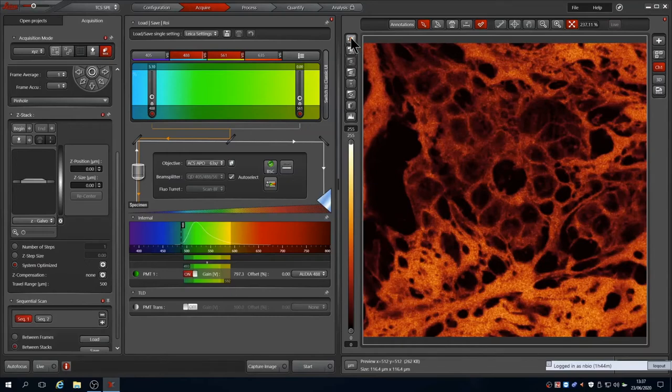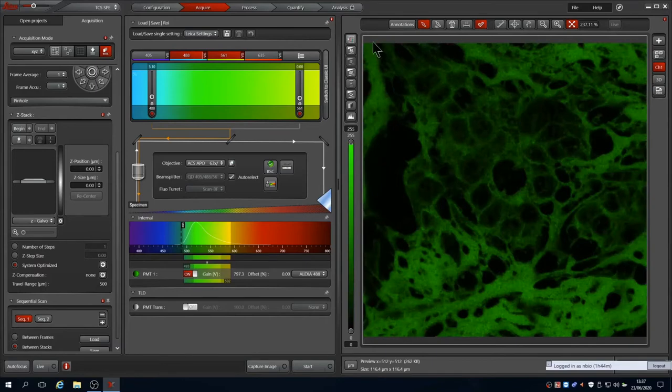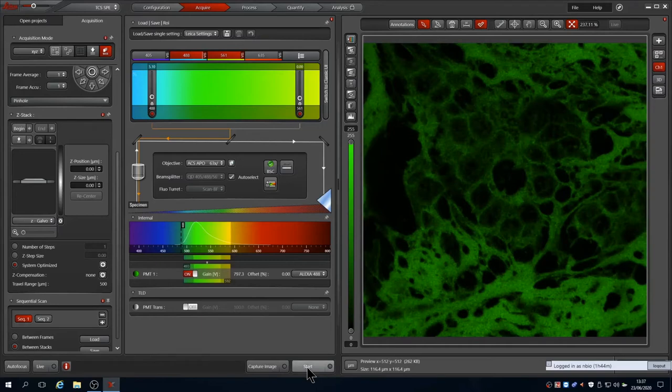You can reset the LUT. Clicking the LUT icon once takes you to a grayscale LUT. Clicking once more the lookup table of the current channel. In this case it is a pseudo-coloured green. Now if you press the start button the system will capture an image of both channels with the current settings.